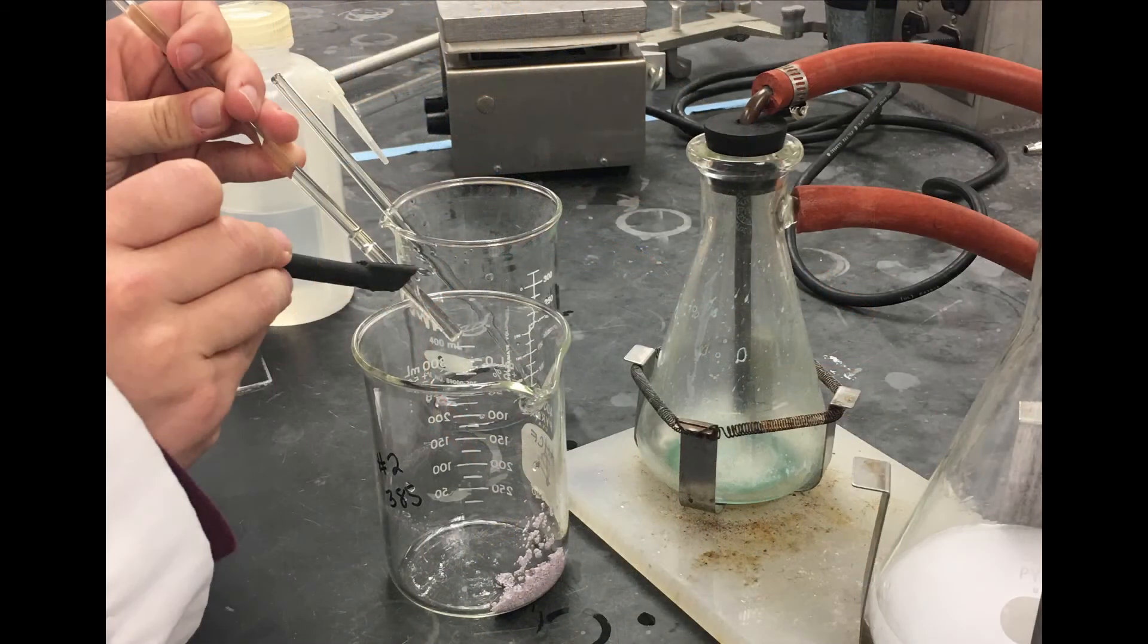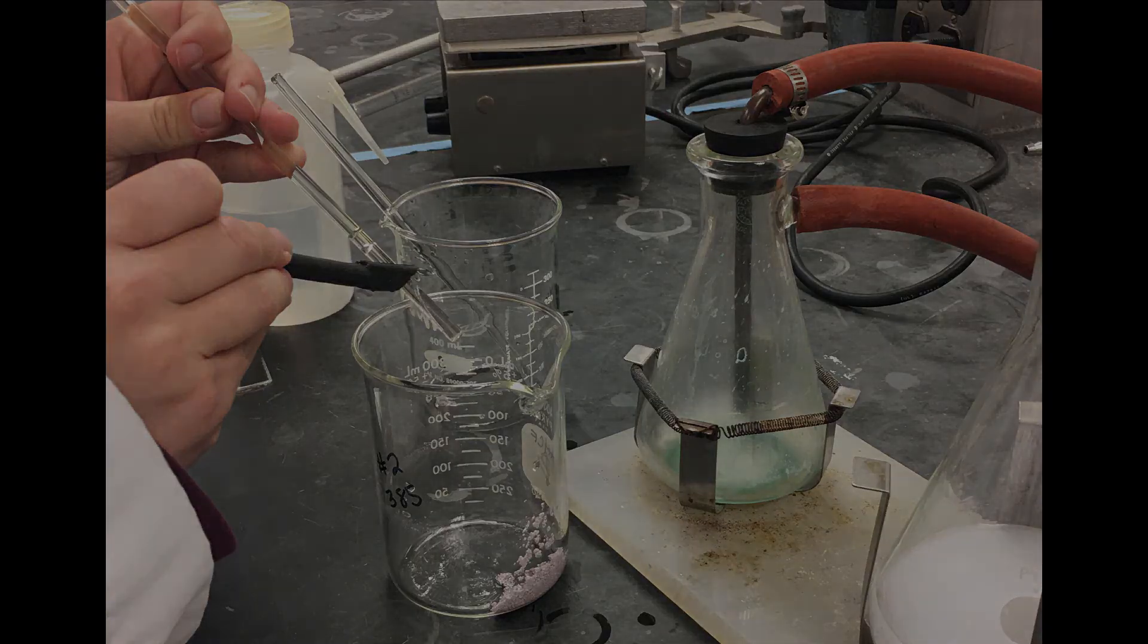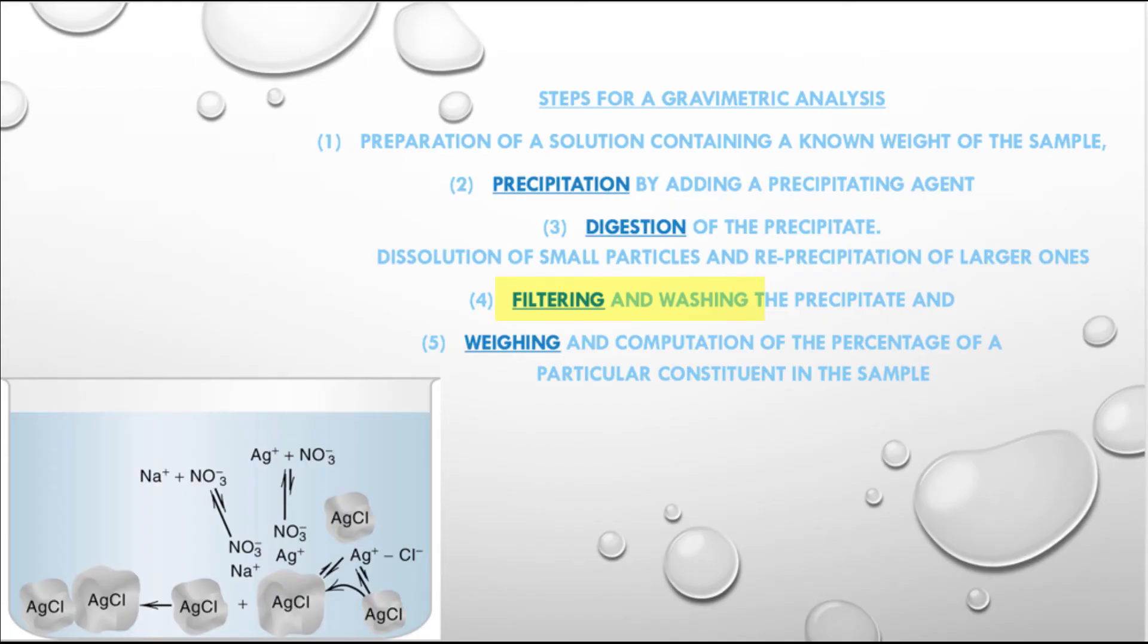Use your rubber policeman and acid wash to get the last traces of precipitate into your crucible. Wash the precipitate with acidic water. Then proceed with drying to bring to constant mass.